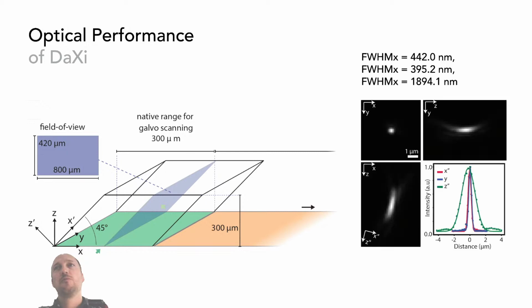In terms of resolution, we have looked at the PSF in the whole volume and characterized it. I don't have the data here, but if we look at one bead in a reasonably central position, we have a resolution between 390 and 440 nanometers, and in Z it's more like 2 microns, and that's pretty stable throughout the imaging volume. We did that in the past months for a resubmission of our paper. So very nice optical performance overall.